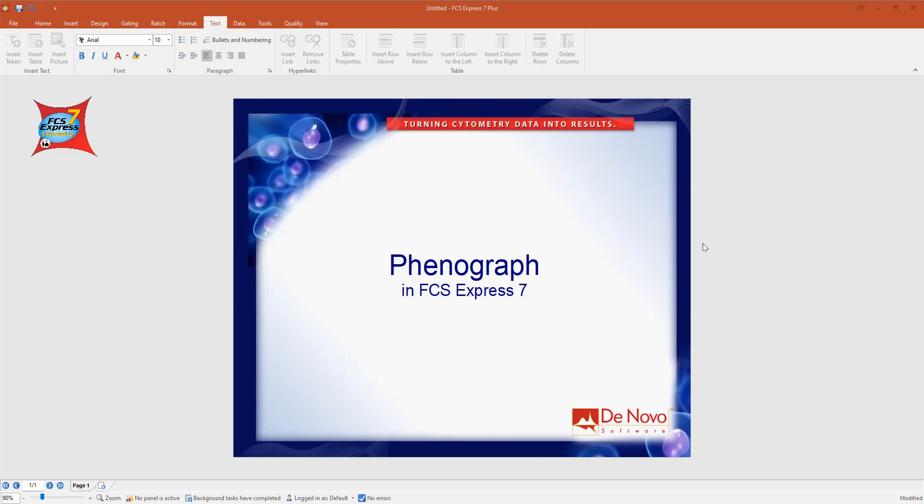Welcome to this quick video guide on Phenograph in FCS Express 7. Phenograph is a clustering algorithm that allows you to analyze high dimensional data.